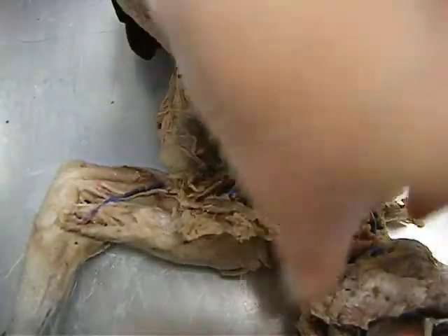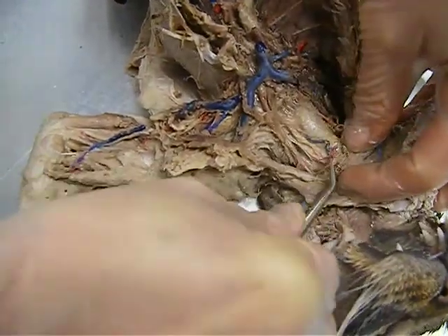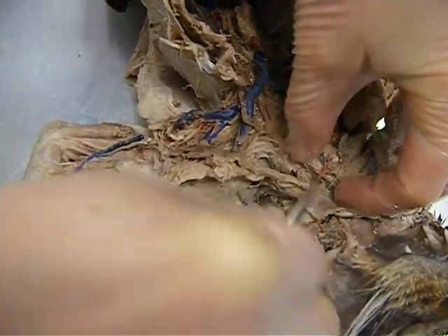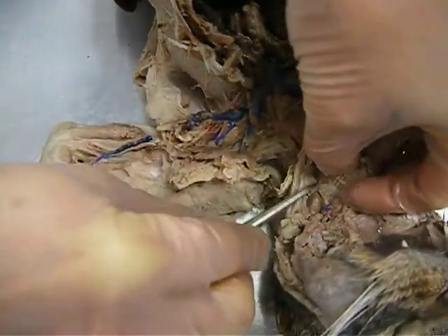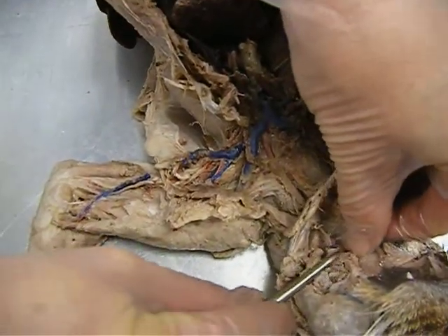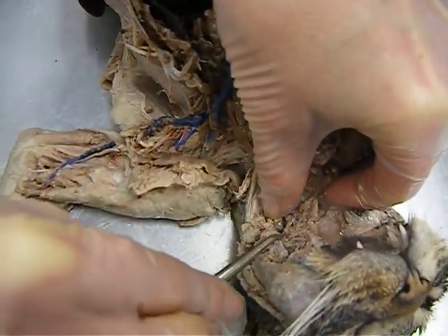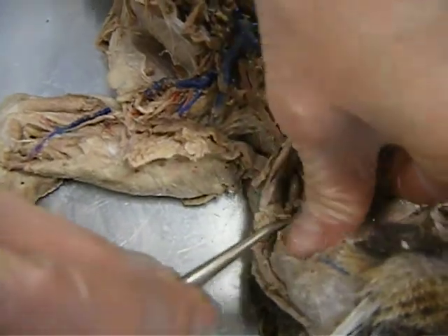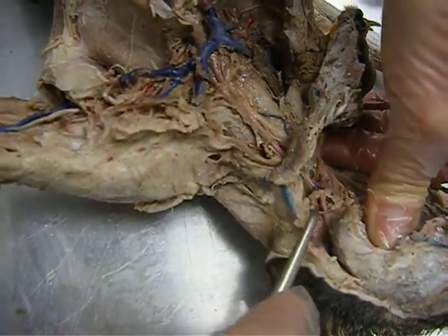You follow up the arteries, and the first branch going into the voice box is the laryngeal artery. Right behind it, going backwards, is the occipital. Going up from there, the next one with the nerve, got cut on yours, is the lingual artery. And then you have the internal going in, internal carotid and external carotid.